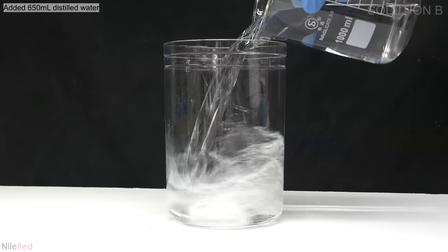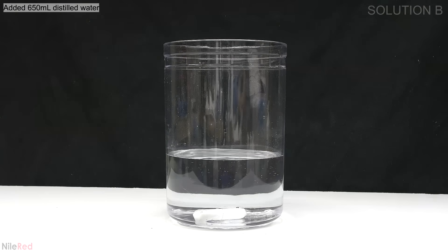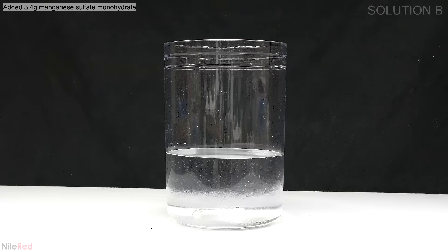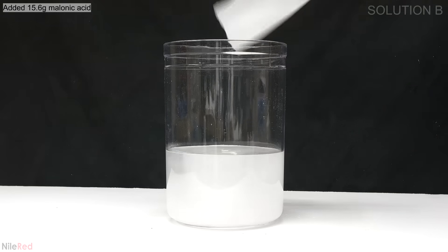Into another plastic container I add about 650 milliliters of distilled water. Into the water I add manganese sulfate and I stir until everything dissolves. When I have a nice and clear solution I add the malonic acid.